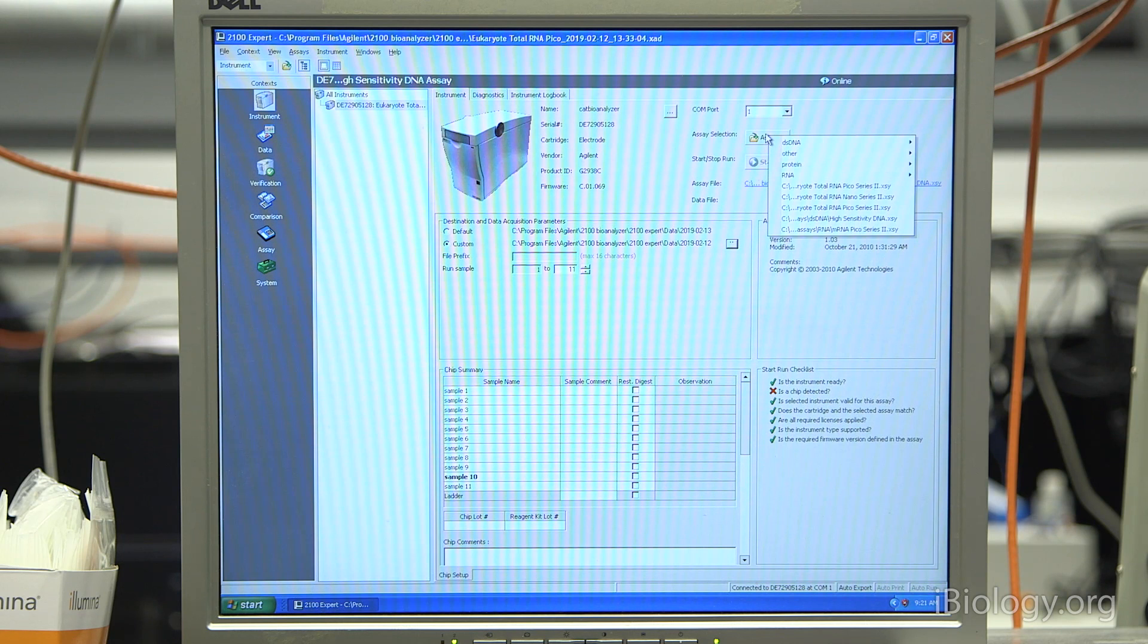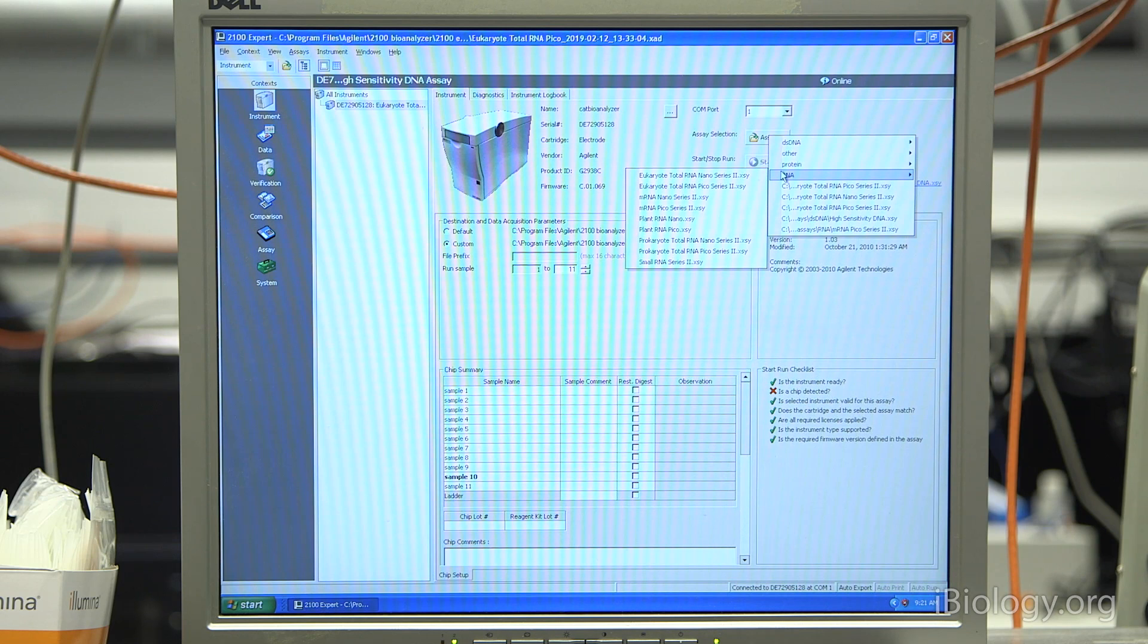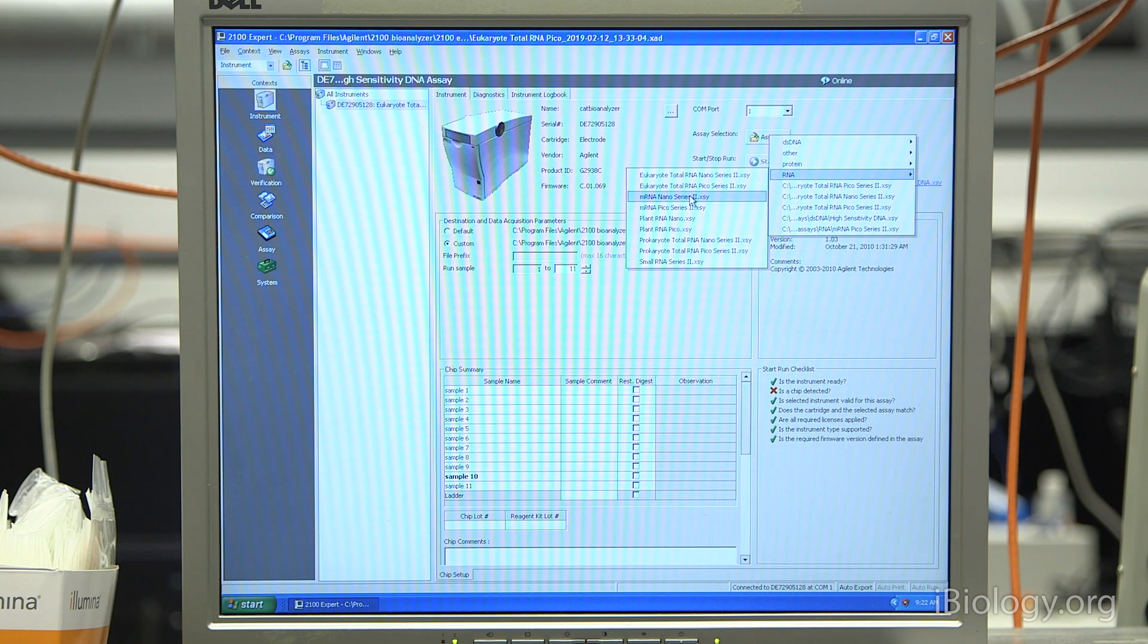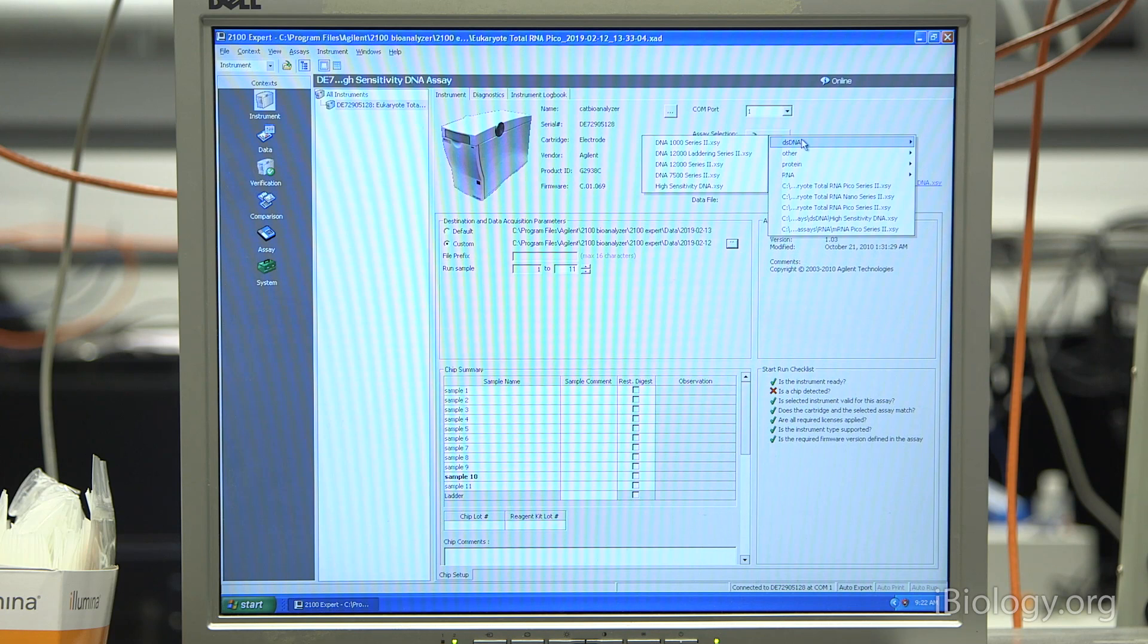The Bioanalyzer can analyze both DNA and RNA. If you're selecting DNA, you want to select the proper chip. Today, we're running the high-sensitivity chip. For RNA, there are two different types of kits: nano and pico kits, as well as a small RNA kit. But what's important about the nano and pico kits, if you're analyzing RNA and want to get a RIN number—this is an RNA integrity number—you have to make sure that you select the total RNA options. This will cause the software to calculate a RIN number. If you select the mRNA options, you won't get a RIN number for your RNA.